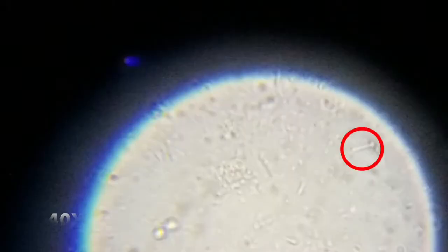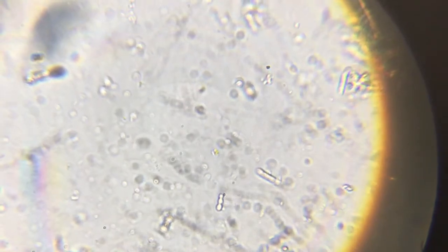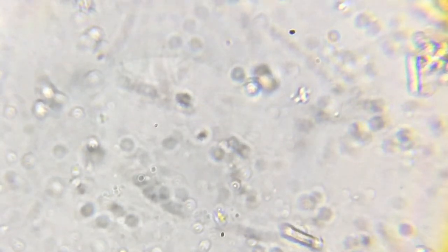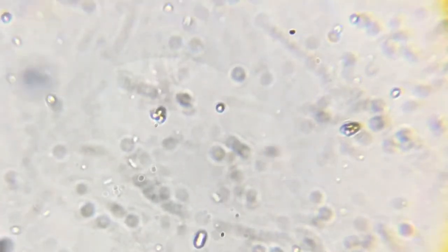If you did not get to see the bacteria, I will circle them now. Now these bacteria, I'm not sure if they're the same or a different type, but they're moving very differently, so I'm guessing they're a different type. Here is a speed up of that video.